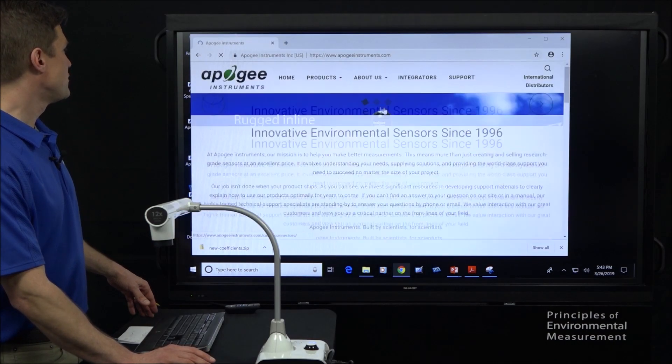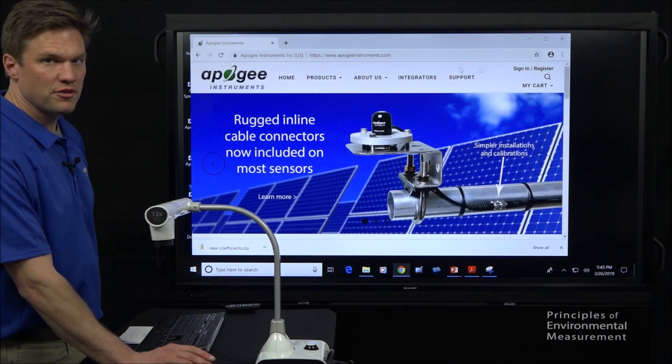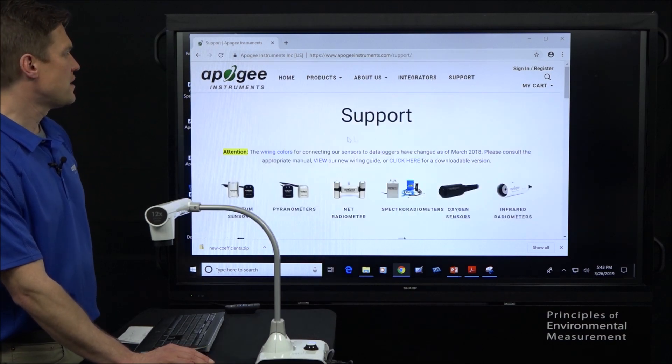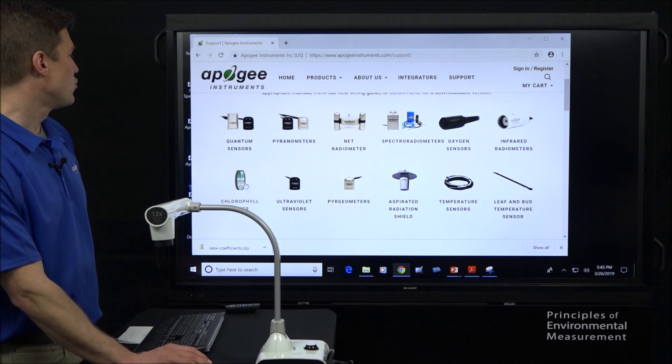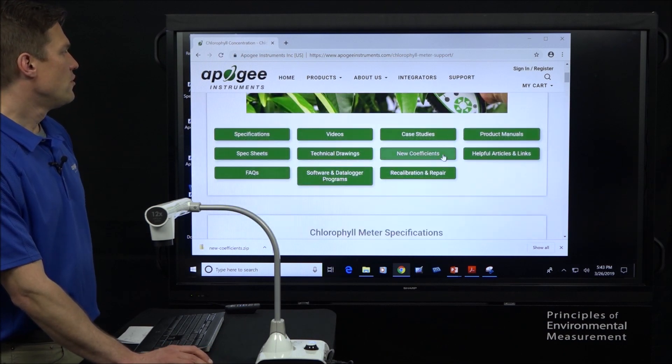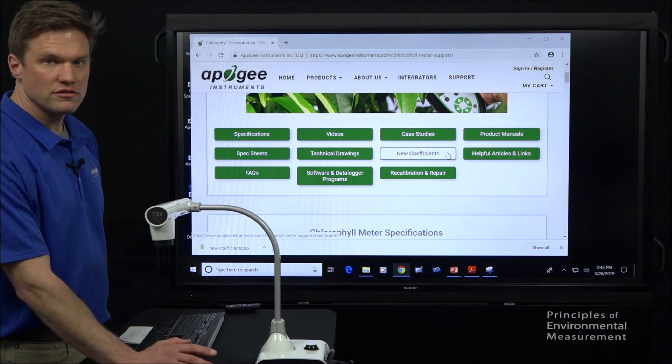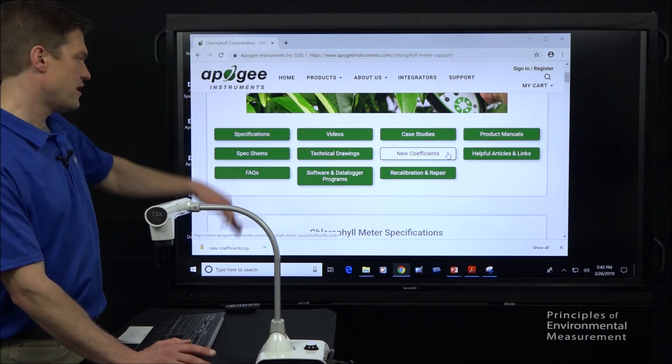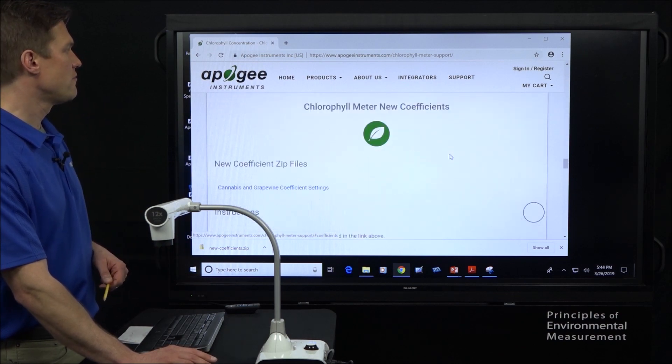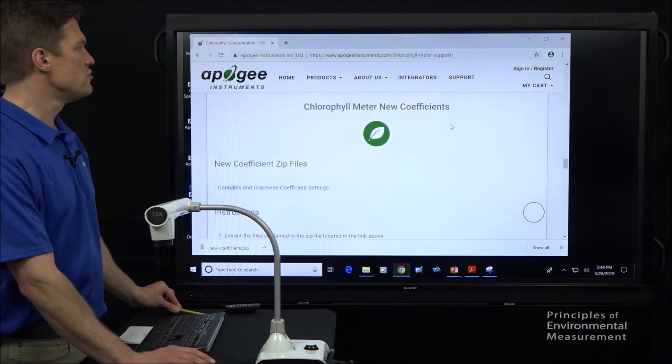You can go to our website, www.apogeeinstruments.com, click on the support tab up at the top and find the chlorophyll meter page. Now, we're on chlorophyll meter support. Right here, new coefficients, you can click on this link and this will take you down the page to the relevant spot or you can just scroll down and get to it that way. But here's the chlorophyll meter, new coefficients.